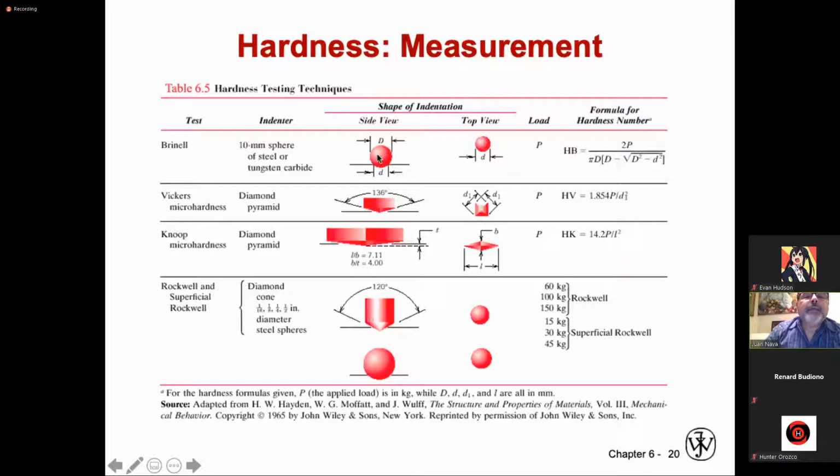The indenter shapes vary, going from soft materials where you are using hardened steel to what we call a Brale that has a conical shape, and that cone is impregnated with diamond. So I mentioned to you our preferred scales are going to be the B and the C within the Rockwell. For the B, you will use a hardened steel sphere, and for the C, you will use the impregnated diamond Brale.